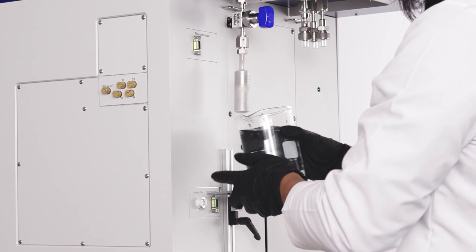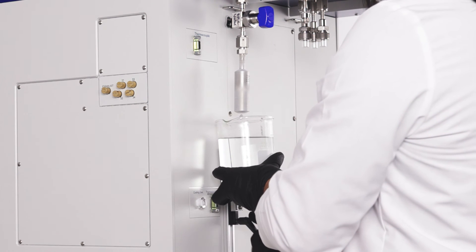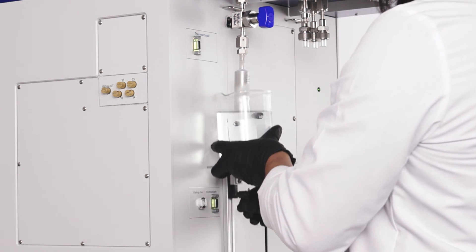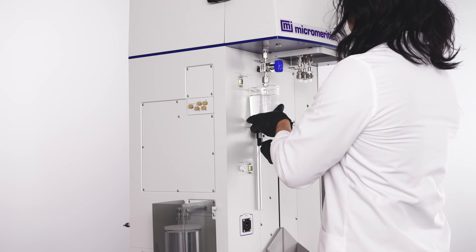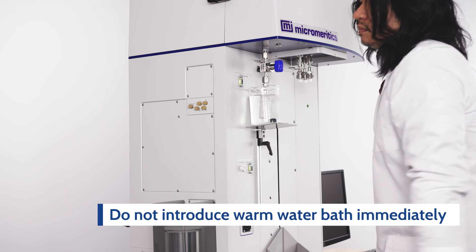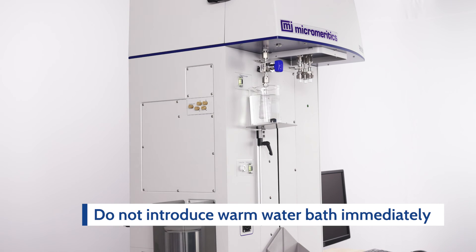To expedite the process, a warm water bath may be used to raise the temperature of the vapor reservoir. However, a layer of ice formed on the reservoir could also create a barrier for heat transfer, so it is best to not introduce the water bath immediately.